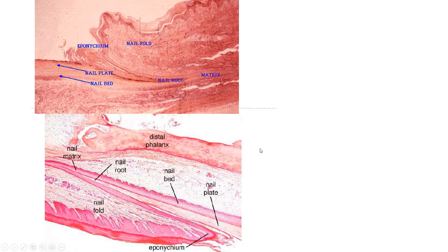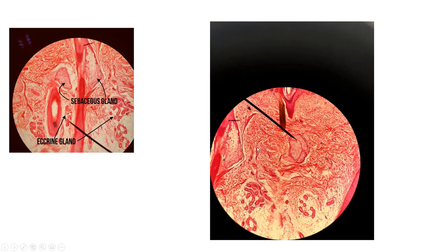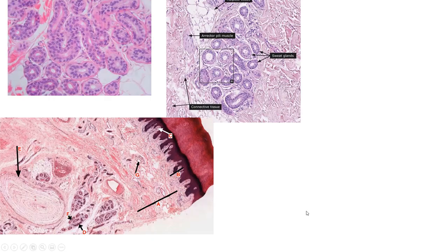Looking at more views of sebaceous or oil glands — here's a good picture next to a hair follicle. You can see a hair follicle here, more sebaceous glands, and also some sweat glands. See how they look like a bunch of circles because you've cut through that coiled up portion of the sweat glands. More sweat glands can be seen here and here.